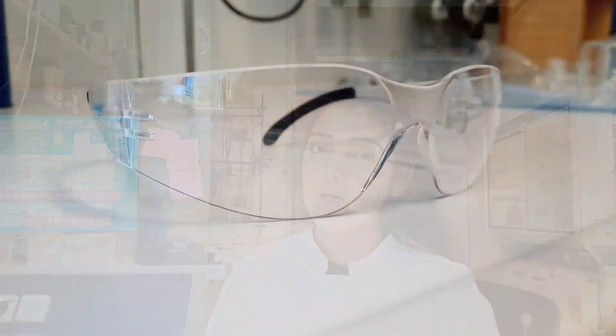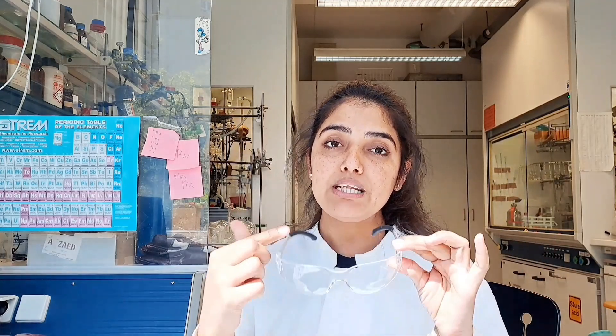Now moving toward the very basic safety goggles, which I also call the beginner ones, because most of the time we use this kind of goggles in school or at the beginning of our bachelor's. These are the basic ones. They give side protection, but have no top protection. We mostly use such goggles for normal chemistry like TLC, washing chemical glassware, or doing titration. This eyewear is perfect for those who are new to the chemistry lab and still adjusting to the chemical environment.